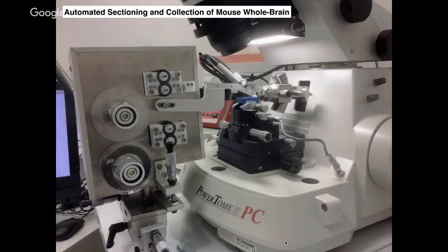And so that left the serial block face approach and the serial sectioning approach. Now, with the serial block face approach, I was working for quite some time with others trying to get that to work. Ultimately, or currently, it is not working. However, about 1.5 years ago, I decided to focus my attention on the serial sectioning approach, because it seemed like it might be better suited for cutting through large samples.